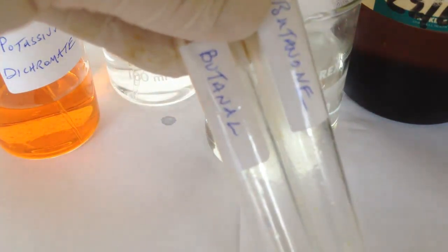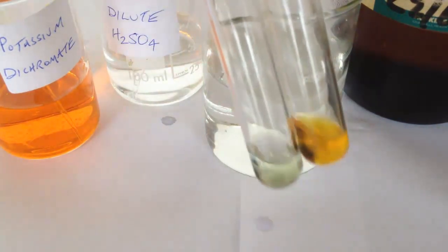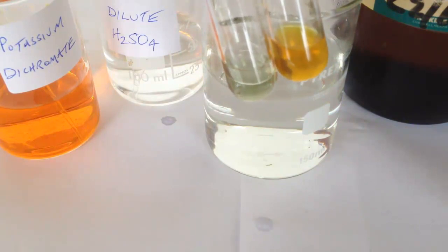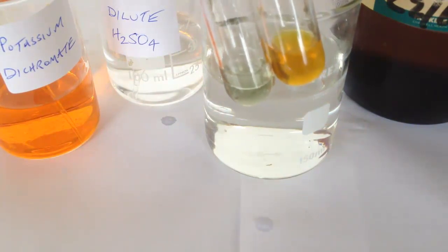So the aldehyde butanal has reduced potassium dichromate from an orange to green colour.